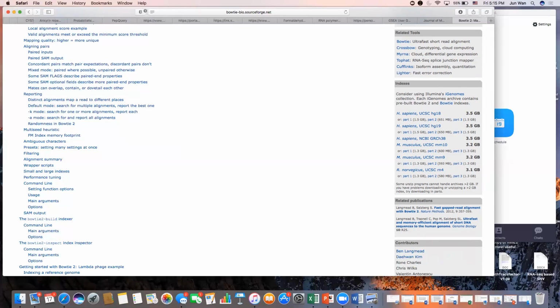Now, the reason that we're doing that is Dr. Bing Ren, when he did all of the FASTQs, everything was referred to against MM10. If you use MM9 or MM8, what you're going to find is the alignments won't completely match up. You're going to have some false discovery and some ambiguous alignments. So please use MM10. All you have to do, again, is click wget right here on your MM10.